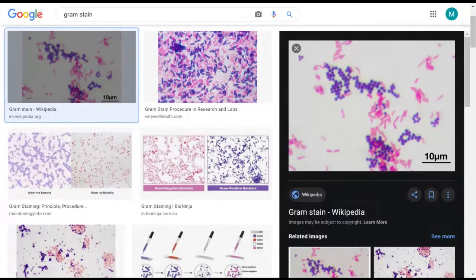The gram negative is a little bit trickier. There isn't enough there. If this was an actual slide, I would have to look more around because you do see some palisades. And when you see a little bit of another chain here, I do see a lot of side by side, to where the gram negative you could venture to say is a palisade. The gram positive is clusters. Because when you have fewer of them, you don't really see anything but clusters. There's a little bit of a chain right there. I don't know if you can see my pointer. But anyway, when you have fewer of them, all you see is clusters. So this is really cluster as far as the gram positive goes.